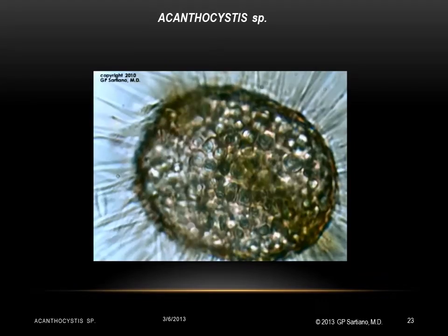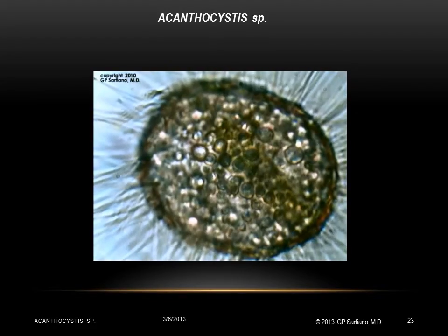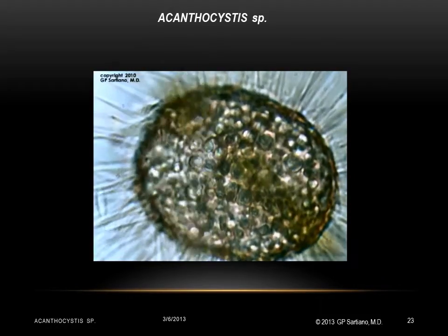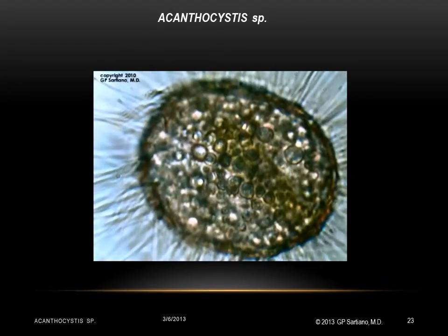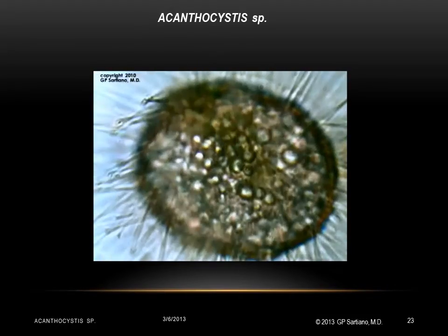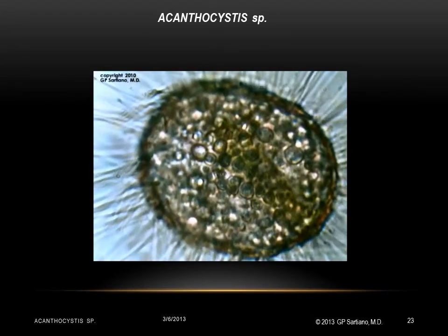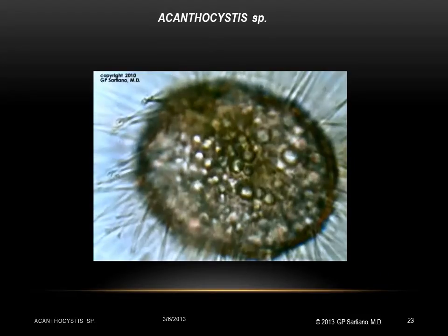Numerous endosymbiotic zoochlorella can live within the cytoplasm of Acanthocystis. This is the reason why the organism is often referred to as the green sun animalcule.